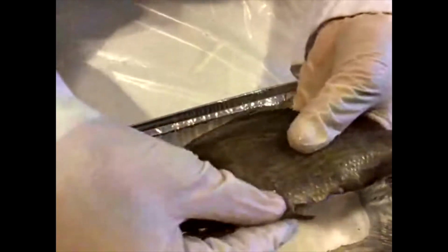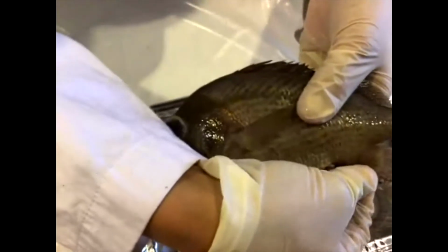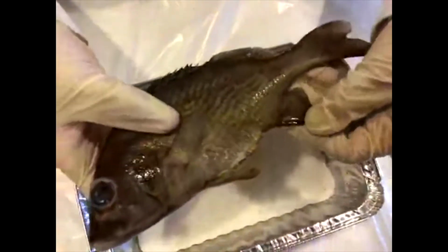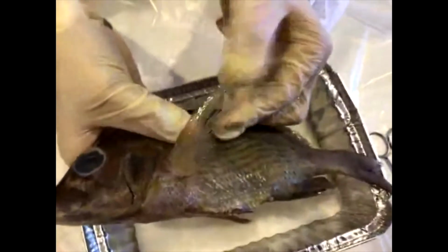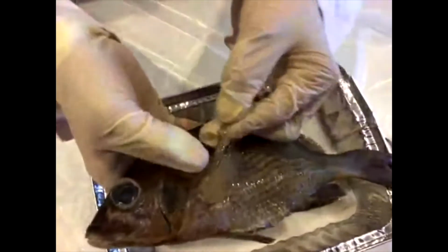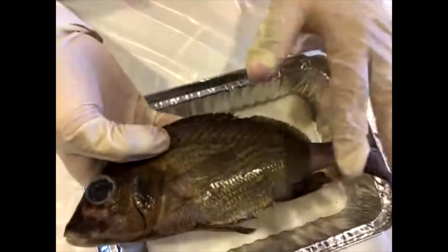And then you'll also notice they have a few pelvic fins here down at the base. These also have bones. So as I stretch them out, you can see the shape and you can draw that along. And then they also have a pectoral fin here. This one's a little bit different, the bones aren't as hard, but the rays spread out a lot more. Now, these pelvic fins down here and the pectoral fins here, these are what allow the fish to steer.